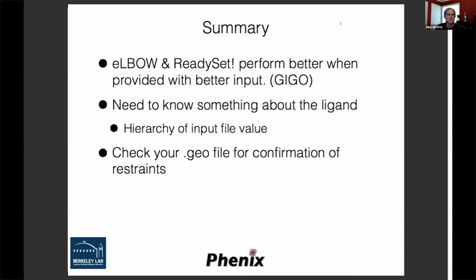They're actually using it inside some of their other packages, so they have to have it working, but it's not compatible with some of the other things. It's not currently at all easy to set up separately, unfortunately, because it really does work. When it's set up and working, it actually is very powerful. So we can hope that they fix that. I think it would help, Robert.